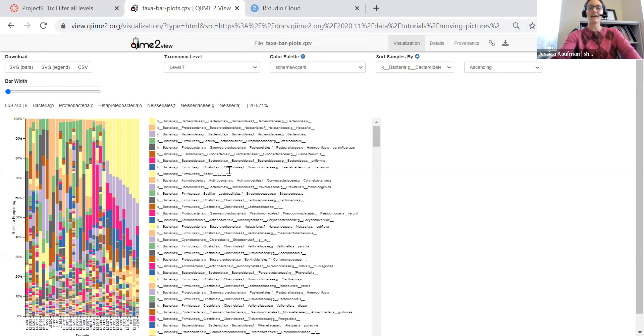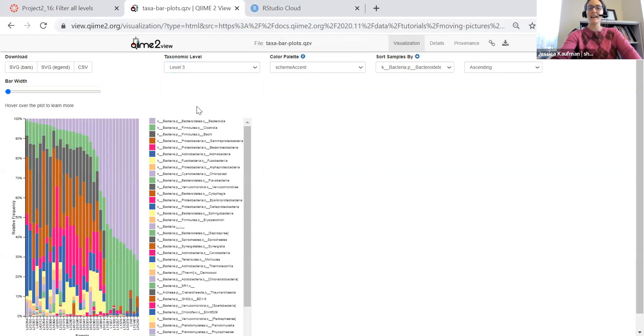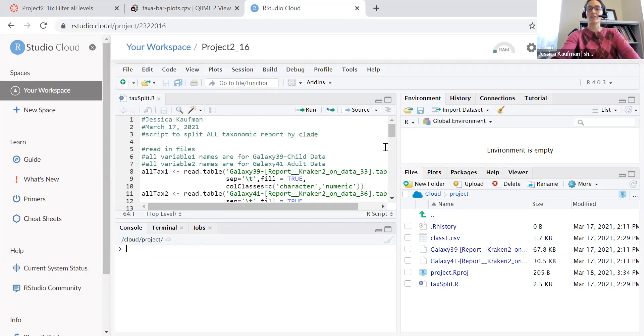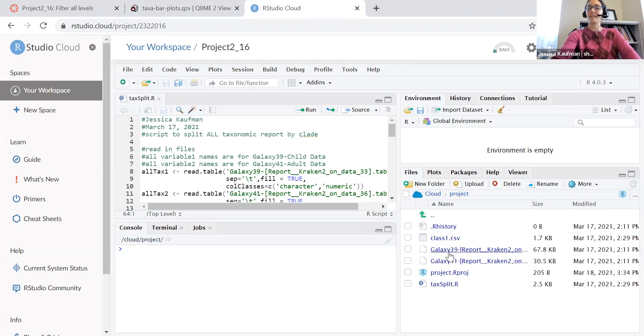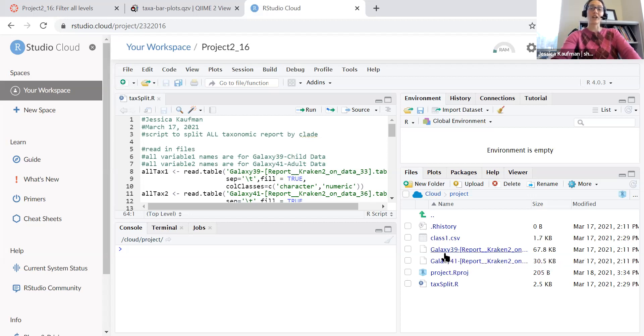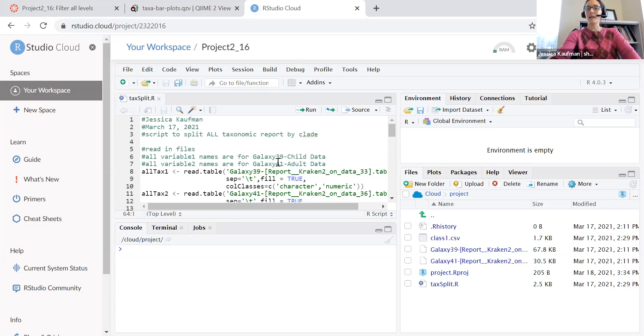So how do we do this? How do we split up the data at every level? Well, the first thing you're going to do is you're going to want to start a new project on RStudio cloud and get the two original files from Galaxy. So mine were step 39 and 41. Step 39 is the data corresponding to the child microbiome. Step 41 is the data corresponding to the adult. So I put that in my comments here just so I can keep track of which file is which.